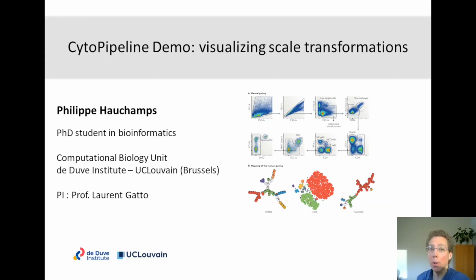Hi everyone, and welcome back to this series of short videos devoted to CytoPipeline, an R tool for building and visualizing pre-processing pipelines for flow cytometry data. In this video, we are going to extend our visualization capabilities. Indeed, we are going to demonstrate another Shiny application which enables us to visualize scale transformations and possibly proceed with some manual adjustments to some of them. So, let's get started.